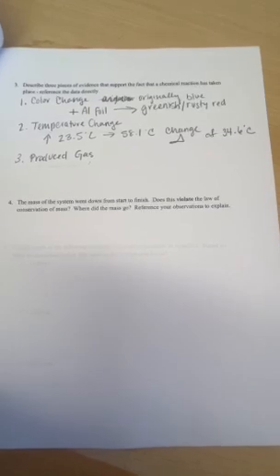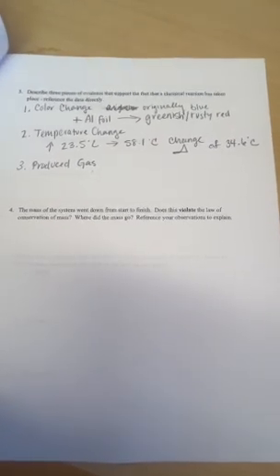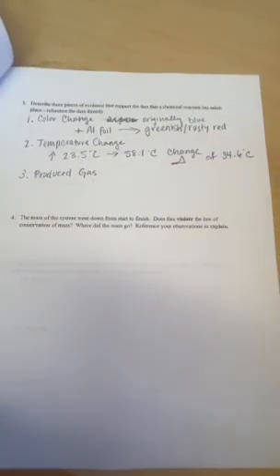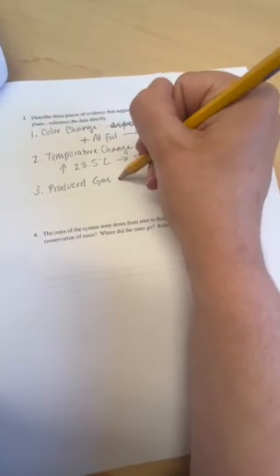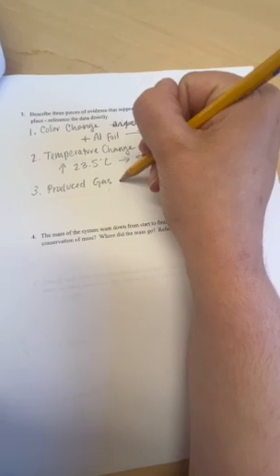We also had some condensation going on the sides of the container. And really what we saw was a loss of mass, which could be explained by this gas. And that also tells us that we have a chemical change.